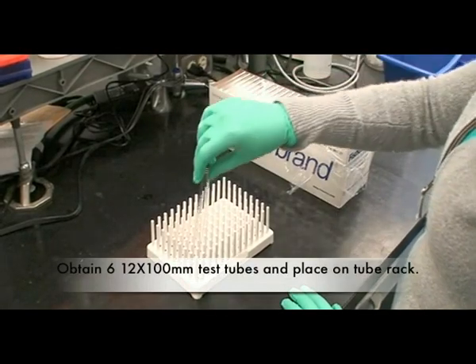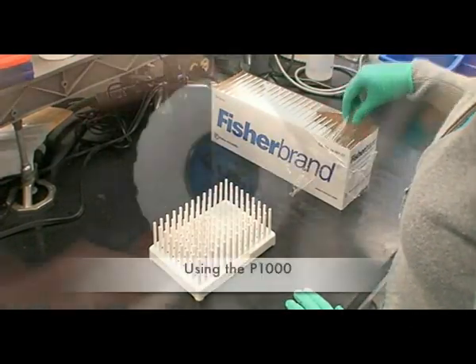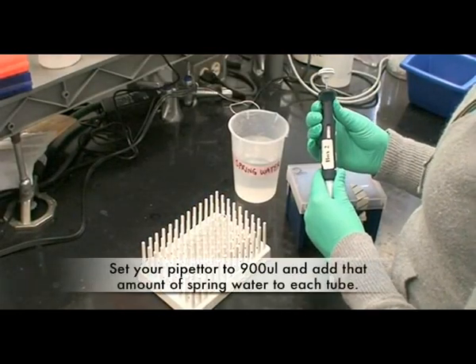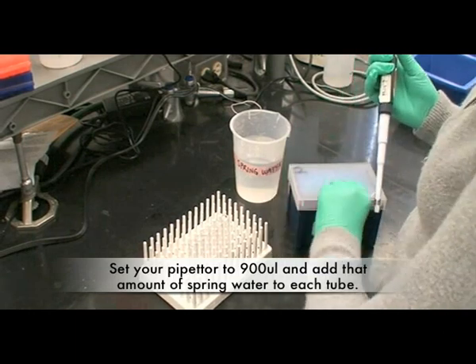Obtain six 12 by 100 millimeter test tubes and place them on the tube rack. Using the P1000, set your pipetter to 900 microliters and add that amount of spring water to each tube.